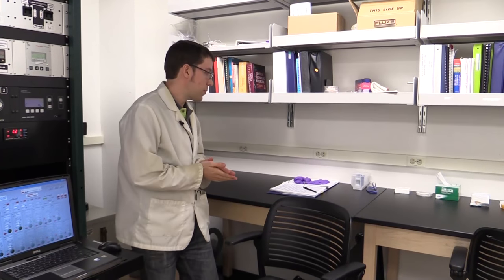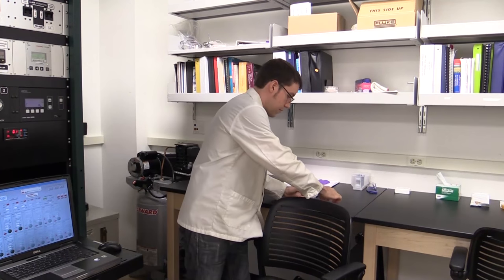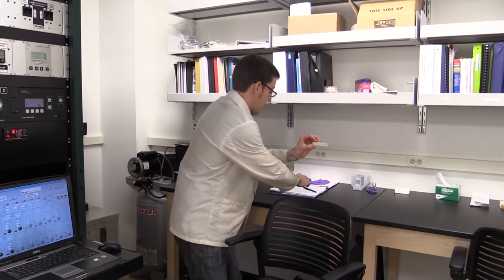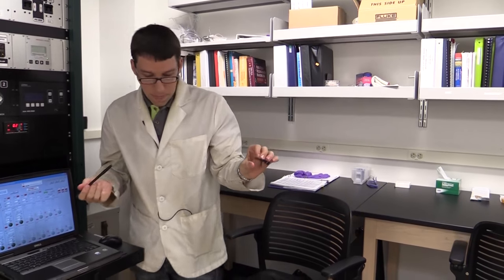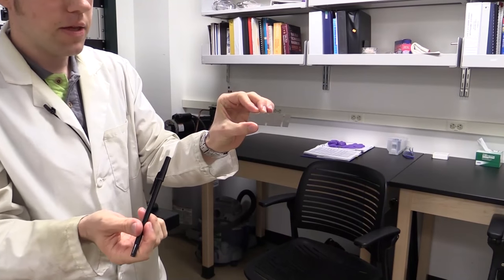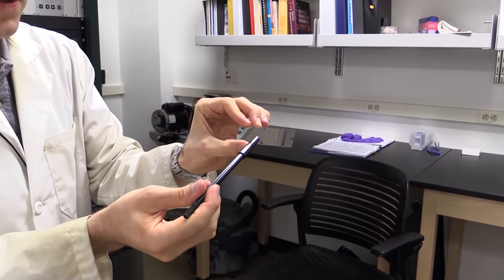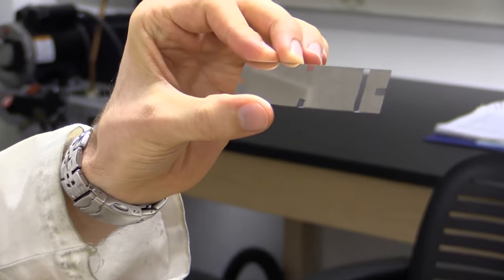For a final product, which I've already prepared, I've got a thin film on glass. You can see it's reflective, it's just a mirror basically. In this case, the material is actually aluminum. The clear spots are uncoated substrates. You can see that they're transparent because this is a film on glass.